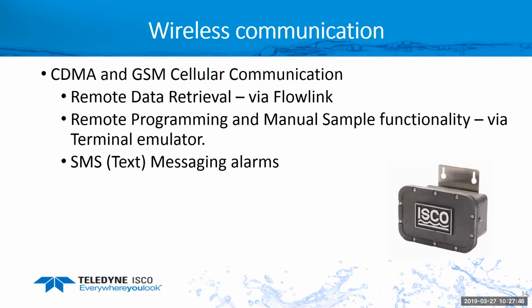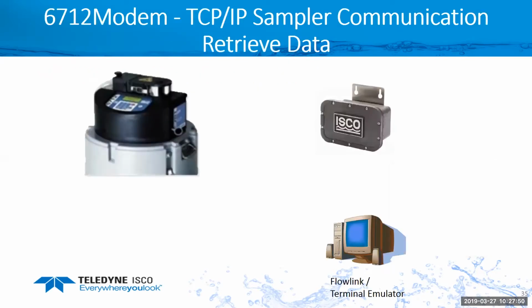So, a little diagram of how this works. If you were to call in to the site remotely, either with a terminal emulator or Flowlink, the person at the computer basically calls out with the IP address to the sampler.